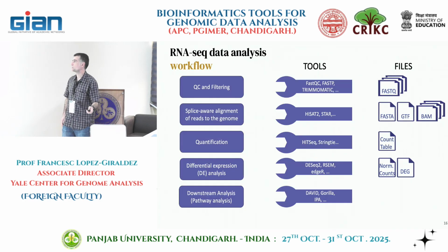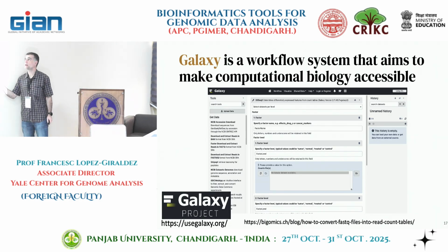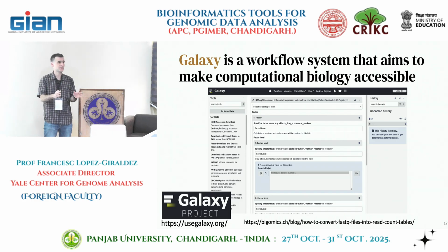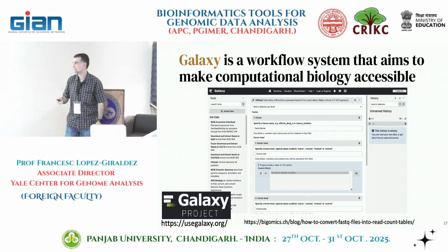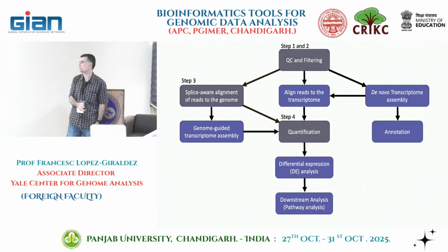For differential gene expression analysis, that's for tomorrow. I'll show you Galaxy before, but everything, I think I mentioned yesterday, everything we do you could do in Galaxy, right? If you don't want to do command line and you want some generic analysis, Galaxy is your friend. And if you don't have many samples, because it's super slow. Partek Flow is the other one that I mentioned, right?